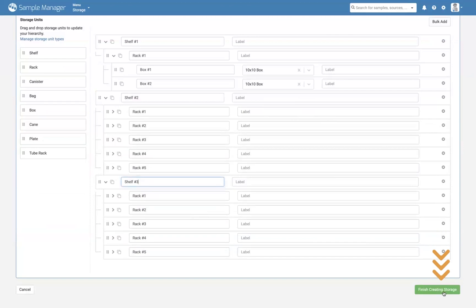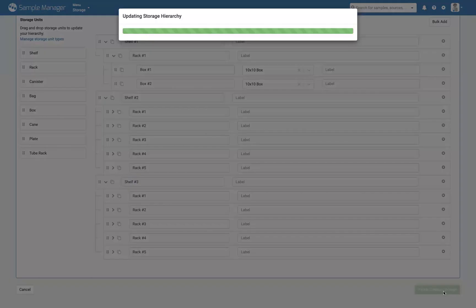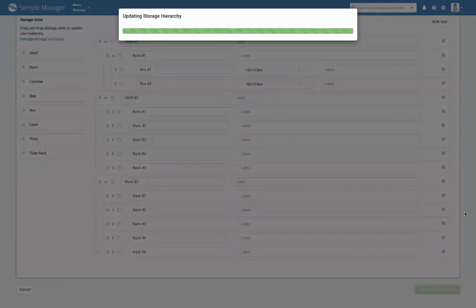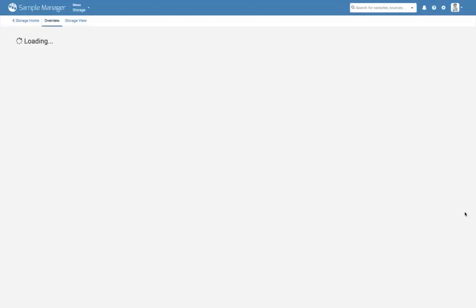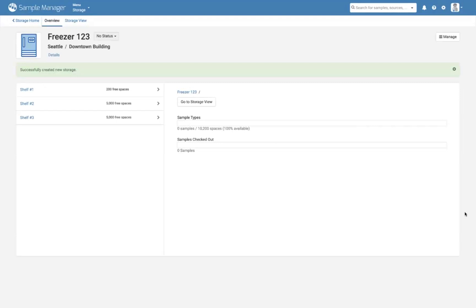Once you're happy with the structure, select Finish Creating Storage. Now you're ready to add samples to the freezer.